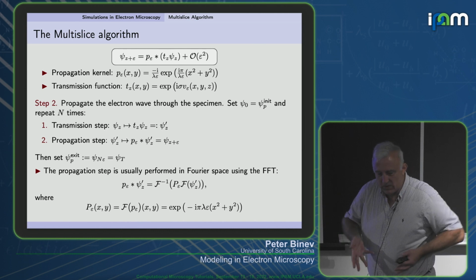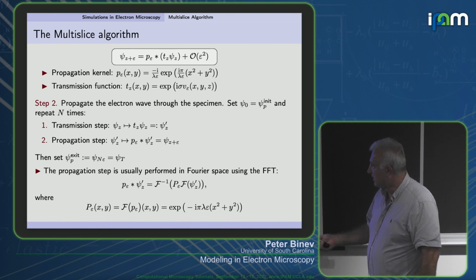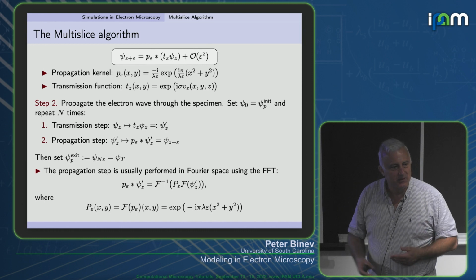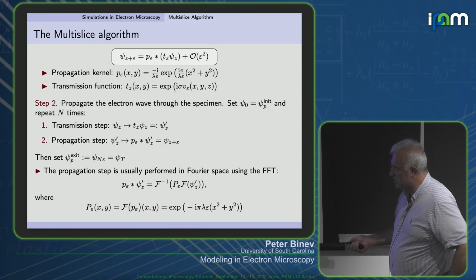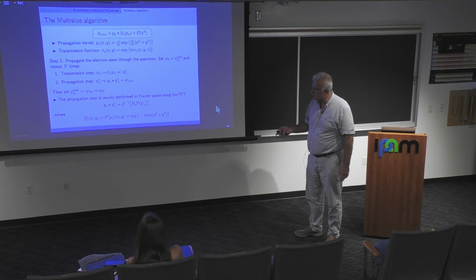And you want to calculate only this small part, and calculating the Fourier transform for the entire sample is probably not very wise. Of course, we can eventually limit that application, but this should be taken special care of, and as you see, sometimes it's problematic.